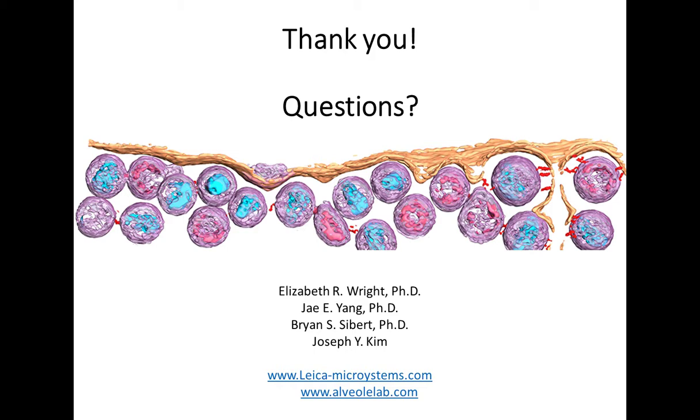And so this can also help control cell density so that we don't have too many cells growing on the grid. We can really position them well. Because if we see too many cells on an EM grid, we can have very thick ice once the sample's vitrified, which makes it challenging to acquire cryo-ET data unless we are incorporating FIB milling into the routine. Is PRIMO micropatterning technique compatible with all EM grids? And is it causing some damages to those grids?